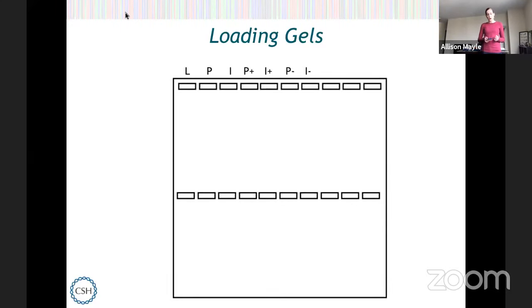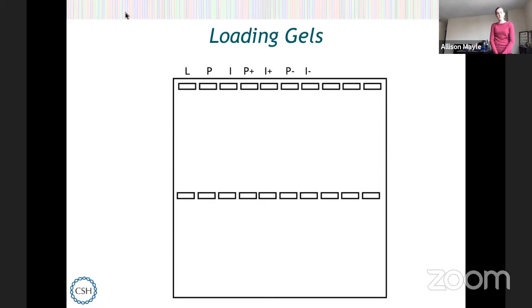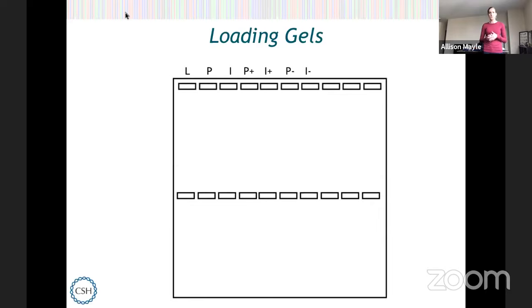Each piece of DNA is going to be glowing. We usually put a dye inside of the gel that sticks to DNA and fluoresces when exposed to UV light or blue LED light. The one I like to use for this experiment — and I believe the same one Dr. Pepinella used — is called CyberSafe; it fluoresces kind of a green color. There are different stains available on the market, like GelRed that fluoresces a nice pink color. The dye sticks to our DNA, and anywhere there's DNA you'll see a glowing spot.